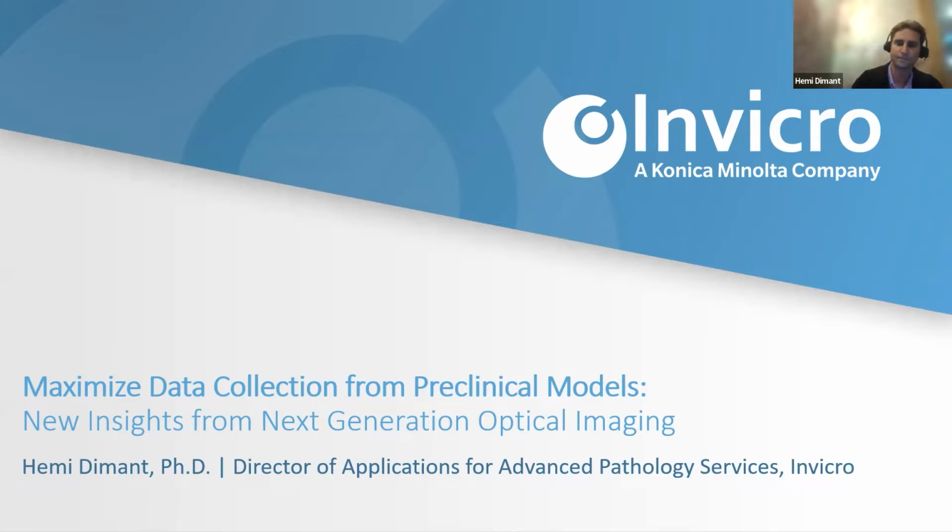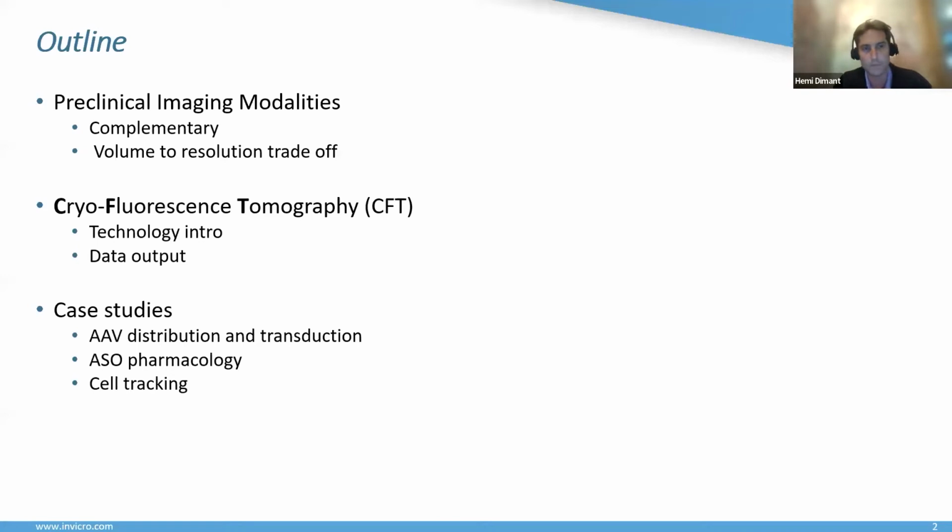we've been doing. So my talk will basically be divided into three parts. Briefly going over the preclinical imaging modalities, the common ones, how they complement each other, where they complement each other, and discussing the volume to resolution trade-off.